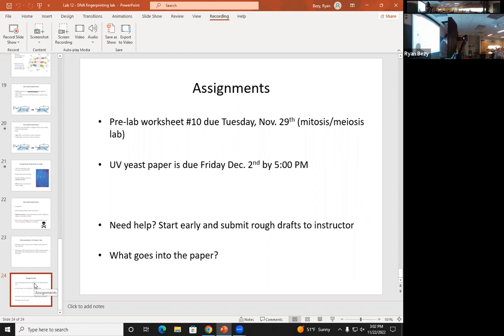So if you don't have a little bit of that loading dye in there, your DNA goes into your well first, and then it starts to diffuse out and float away. In essence, when these enzymes come out, you add the loading dye to it, according to the directions in your lab manual. Then after you've added the loading dye, you load it into the gel. But you got to add the loading dye for it to work effectively. Questions about that? All right. So read through that page 78, but then I'm going to set up the practice gels and we'll get started with that.